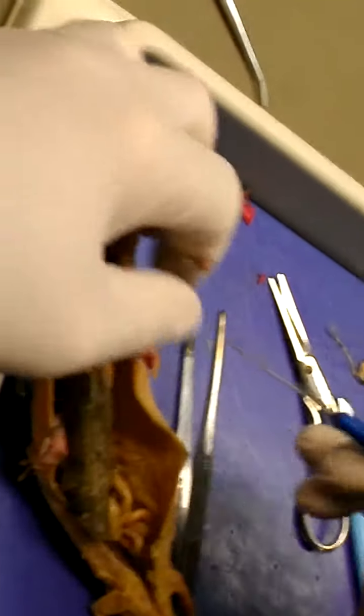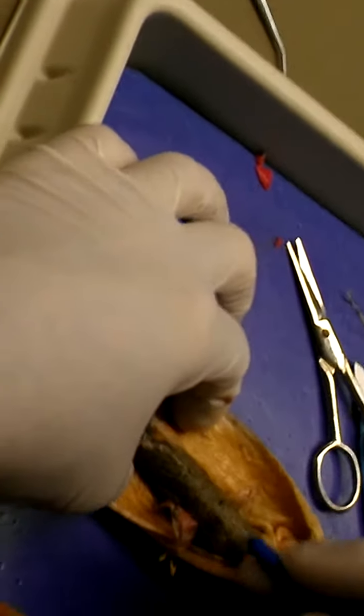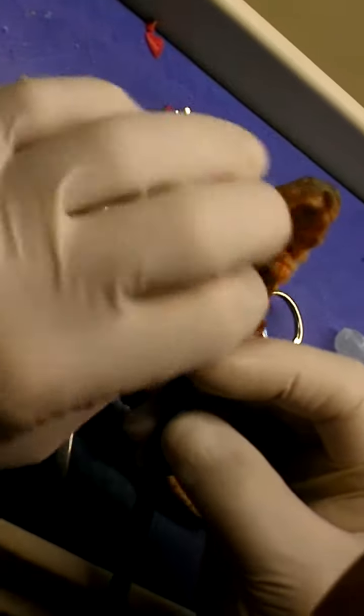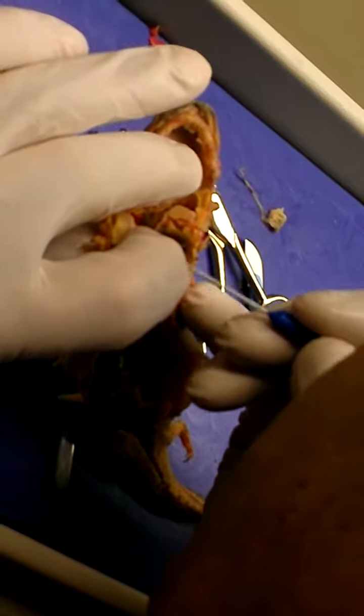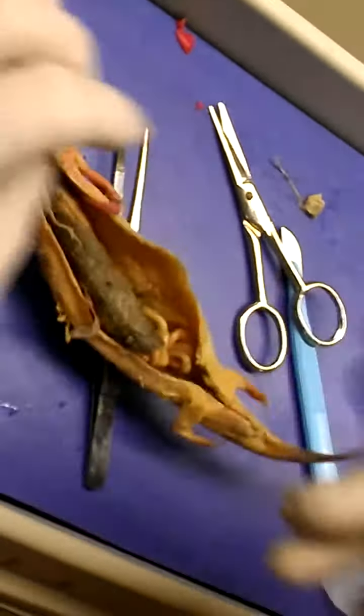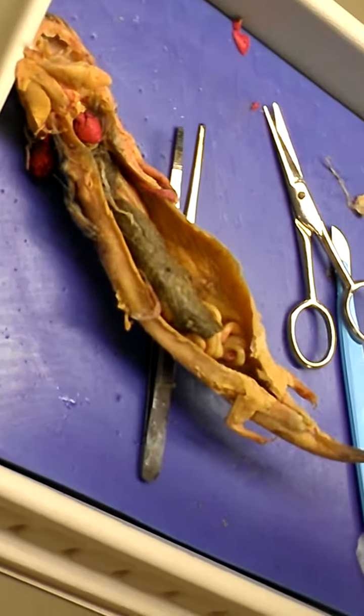All right, and so that gives me this feed that goes into the gills. So if I look carefully on this side right here, I can see the vessel that's coming along here to go into these gills, and that vessel comes along there, and if I stick my probe back through here, it's coming up right there, which is not far from right here. Okay, so the aorta is coming out, it's branching to go to the gills.